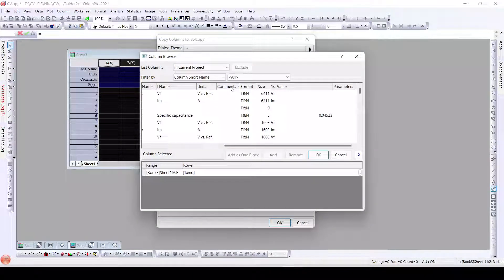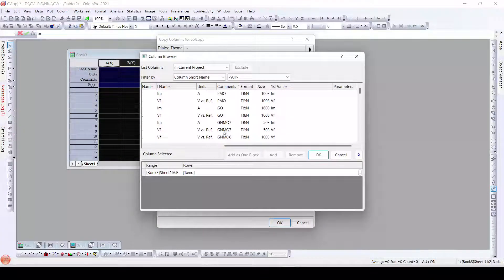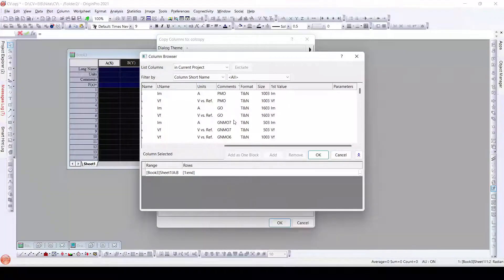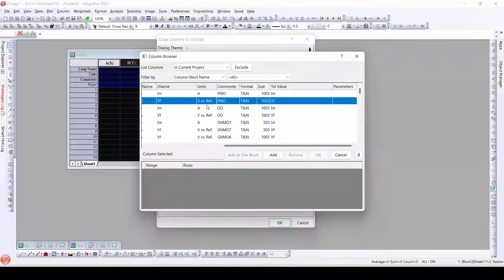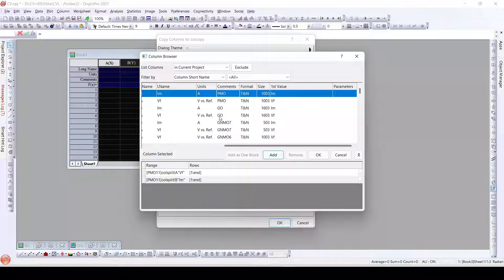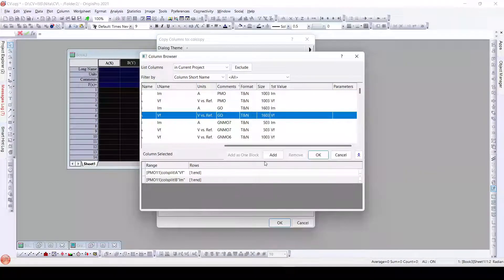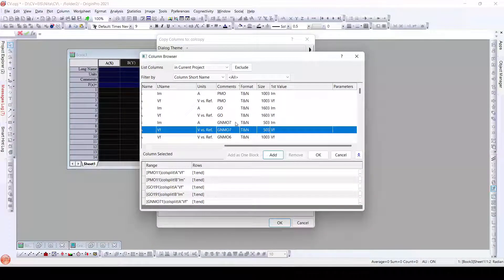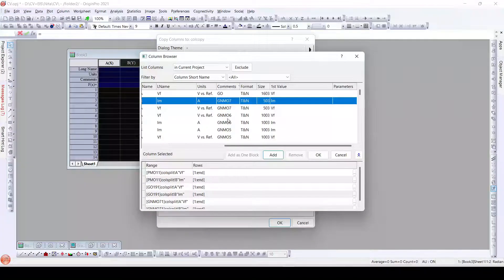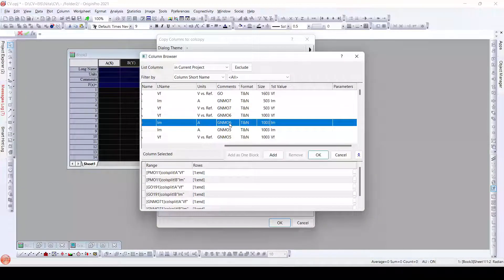I will sort them according to the comments. Once I sort them according to the comments, all the worksheets that need to be added to this particular worksheet can be seen here. I will first delete this. Now as we can see it is CV data — so first the voltage column should be added and then the current column should be added. For each particular dataset, I will add them individually one by one — first the voltage, then the current.